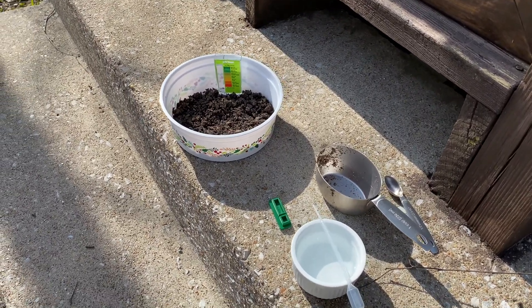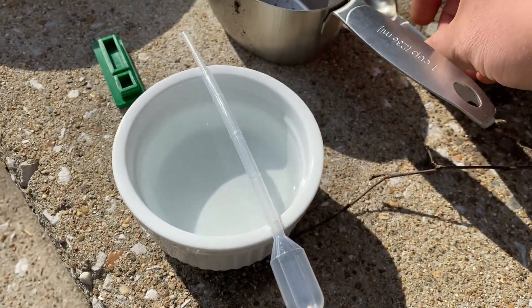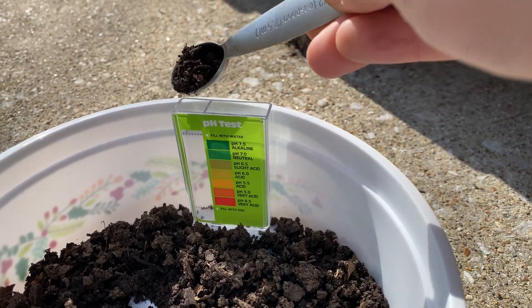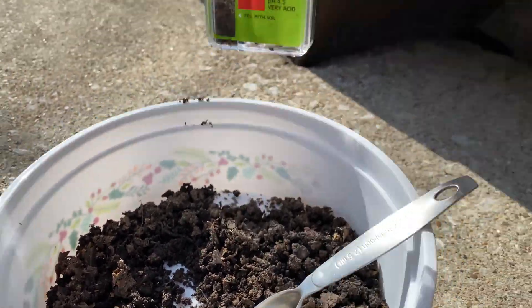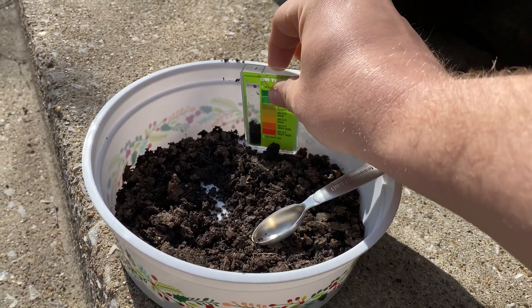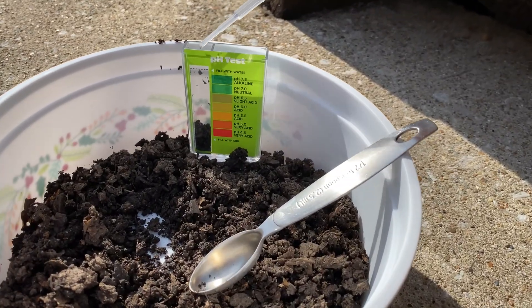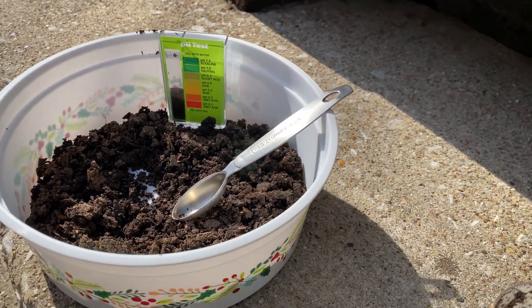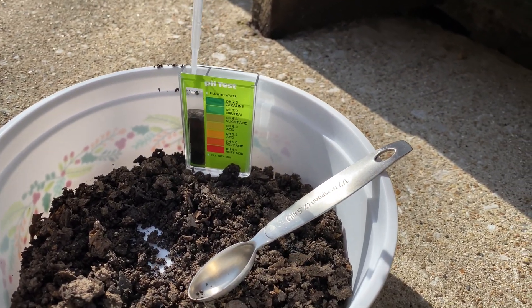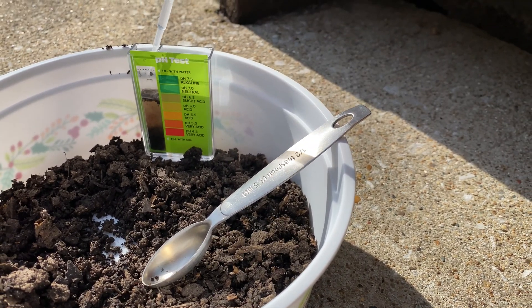Now we have given our soil some time to dry out. We have our test chamber here, some purified water, a dropper, and a little spoon. For the pH test, I'm going to add just a little bit of soil to fill that chamber up — that's about right. Now we're going to use our dropper to fill this chamber with water, just right to the line. I'm supposed to use distilled water, but I'm using water from my filter.